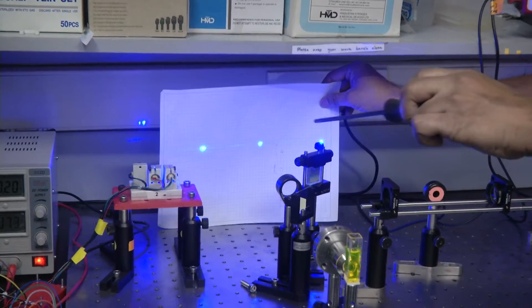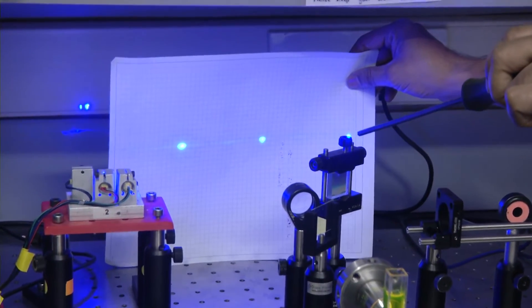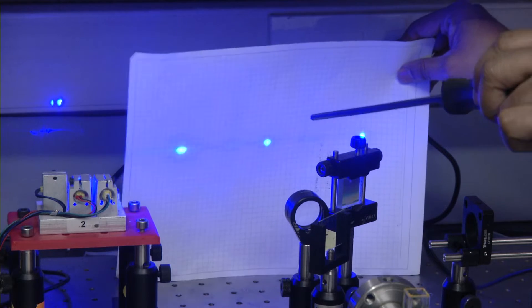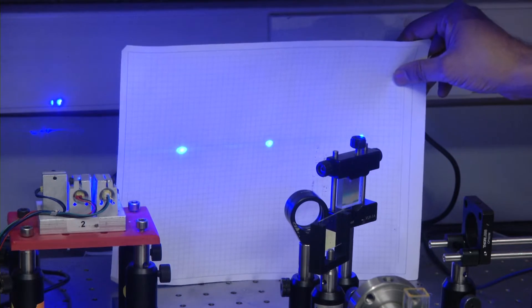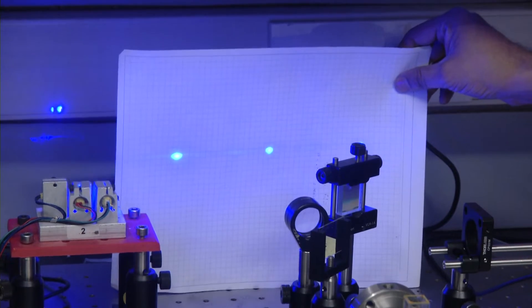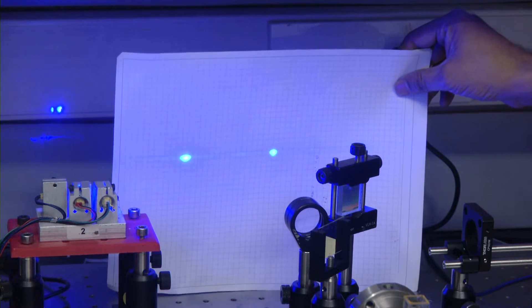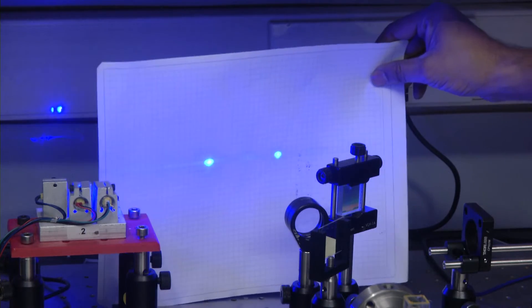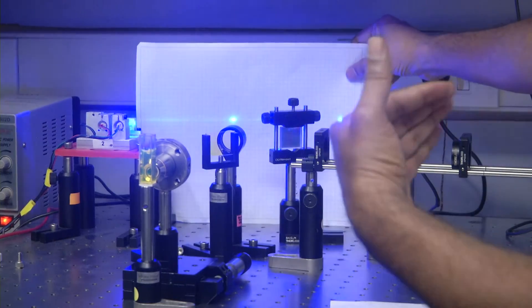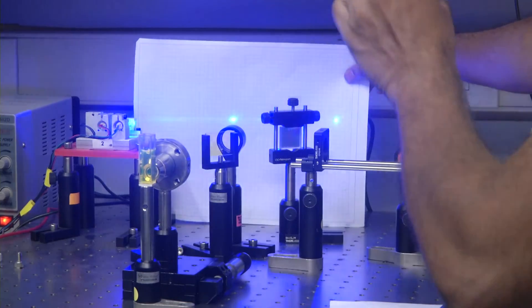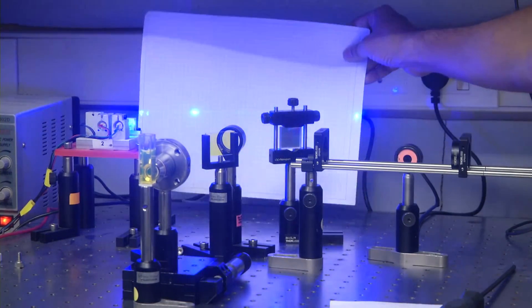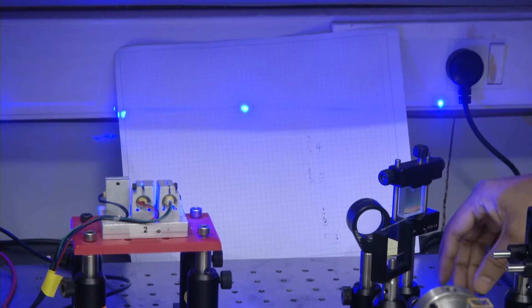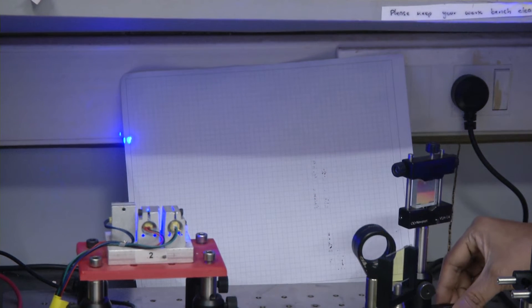So now what I have done is I have placed this grating diffraction grating, reflection grating on the path of laser beam. Usually if it is a mirror you would expect to see just that spot, nothing else. However, what you see now is the first orders on both the sides. You can see that they are slightly more intense than the center beam and you will see this very nicely and distinctly when we look at not the monochromatic light like the laser but actually the multi-color light like fluorescence. When we do that, we will be able to separate the fluorescence that is originating from the solution into multiple different wavelengths.